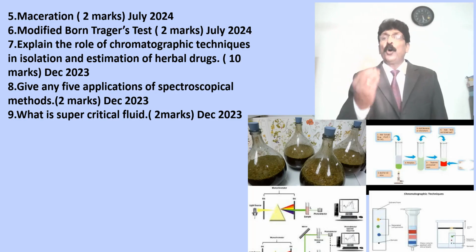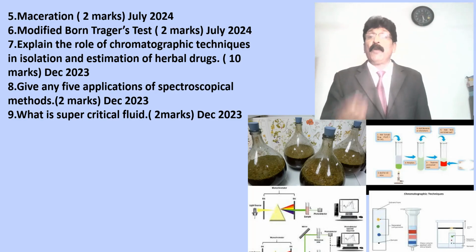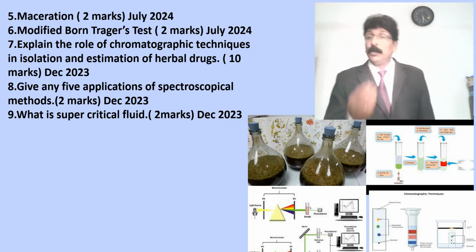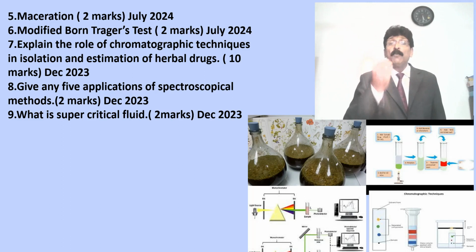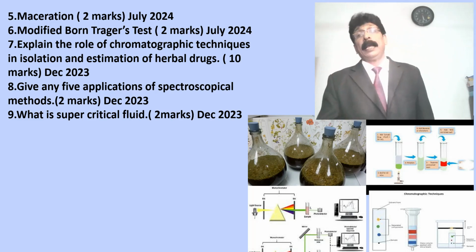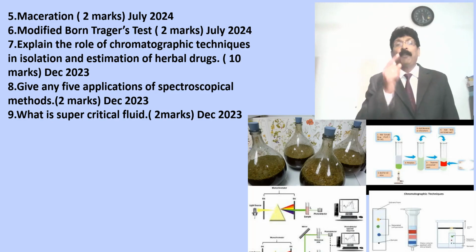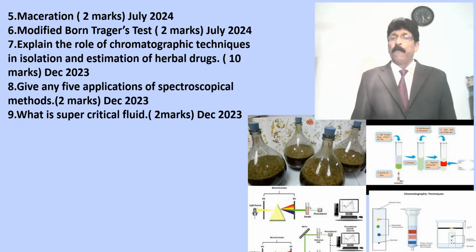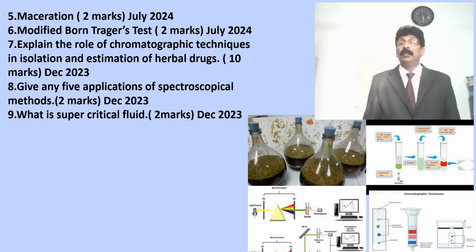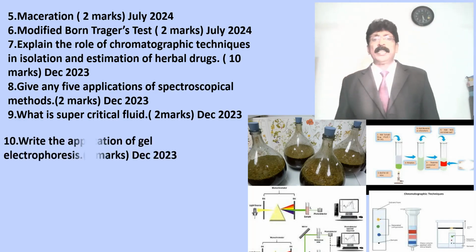So you know that liquid carbon dioxide is used as a supercritical fluid for extraction. It is a new, advanced technique and easy for removal of the solvent system. These are all advantages. There are experiments, examples and explanations given separately for this supercritical fluid extraction method using liquid carbon dioxide. So that is December 2023.